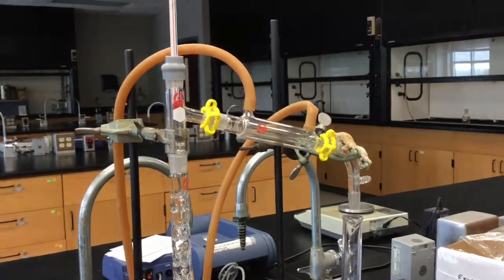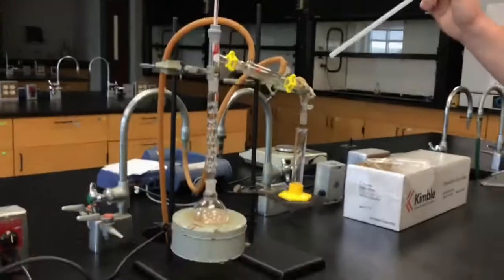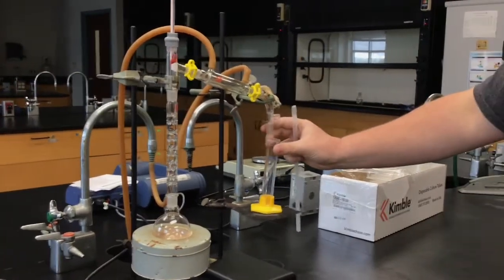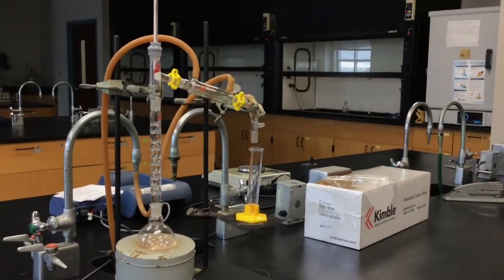On the other side, you've got your out and you have something like a graduated cylinder that you can easily keep an eye on the volume that's in there.